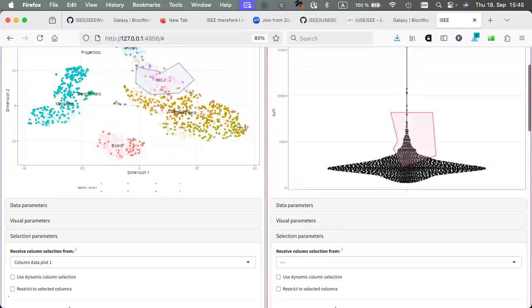That's not the selection. Yeah. So you can always keep the selections. That's actually the beauty part. So this stays there. It's just that it's not there. You can actually have multiple selections, but that's probably material for the I use iSEE.